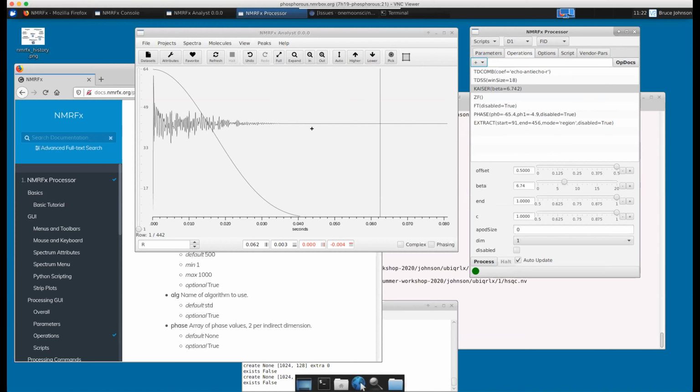Absolutely. And that's a feature that I haven't quite added, but actually the simulate thing that I showed you shows the low level stuff is there to be able to add signals. And we have some other examples where we can generate a simulated HSQC, for example. So that would be a good idea. And as I mentioned, we're adding some of the NUSCON scoring functions in here too. So those things, interactive ability, visualization, ability to add synthetic peaks, I think all together would make a nice tool to play with and address some of these things quantitatively.